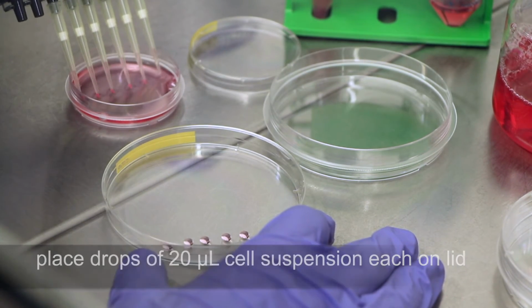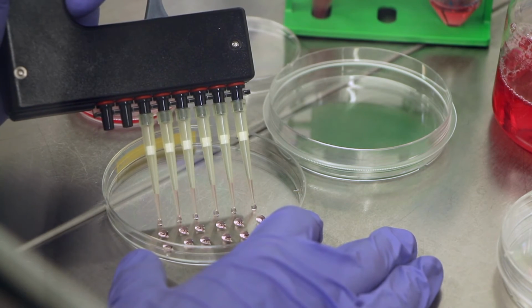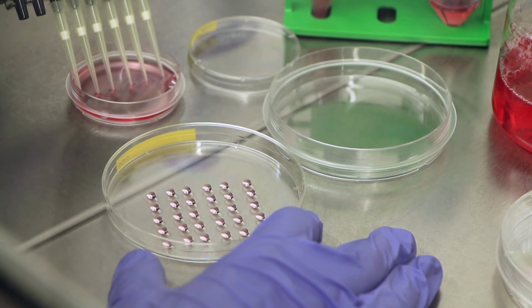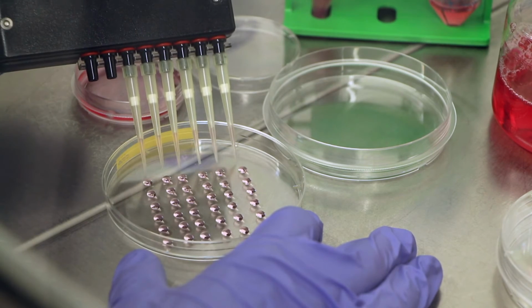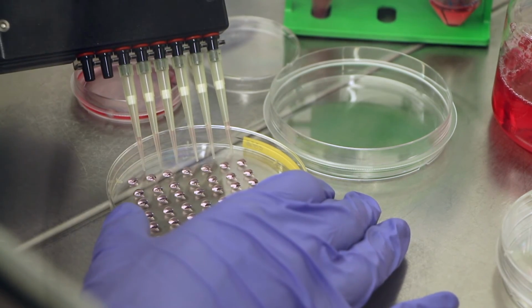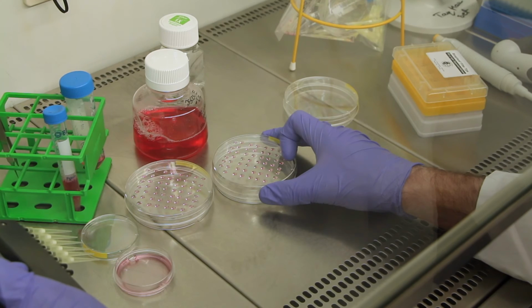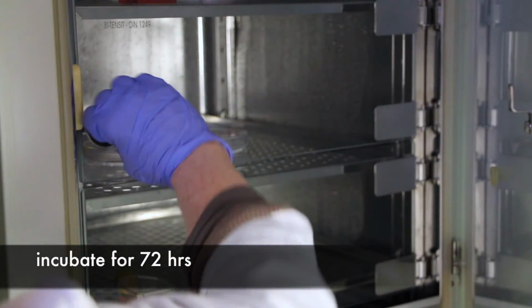Subsequently, 20 microliter of cell suspension are applied to the lid of the dishes with a multi-channel pipette in the form of drops. One drop contains about 750 cells. The drops should be spaced closely together to be able to accommodate as many as possible. The lid is placed on the tray and incubated for 72 hours. By gravity, the cells form cell clusters at the bottom of the drops, so-called embryoid bodies.